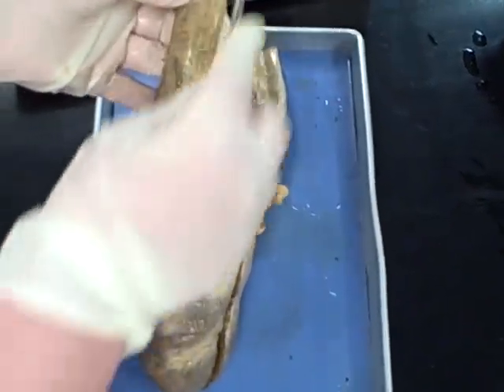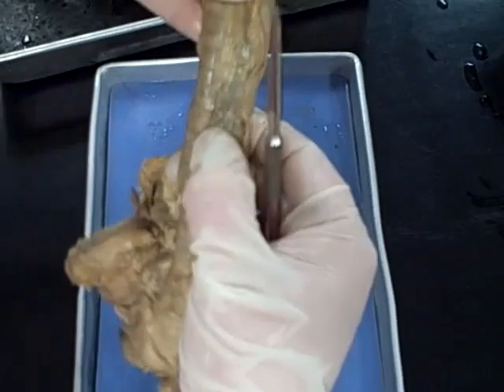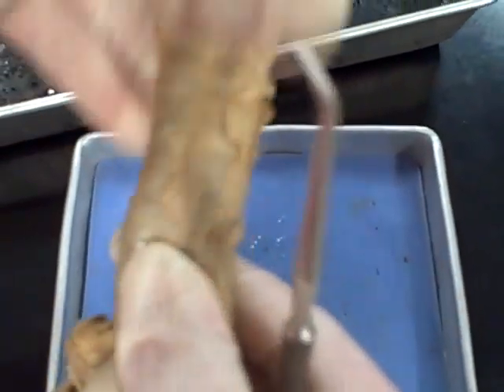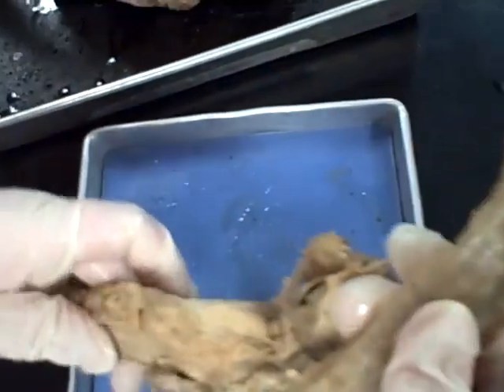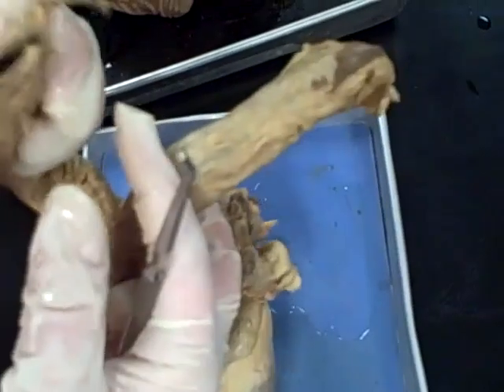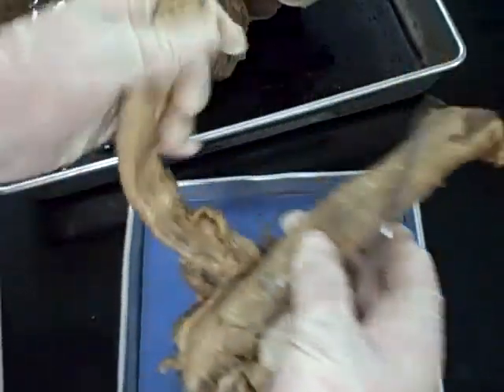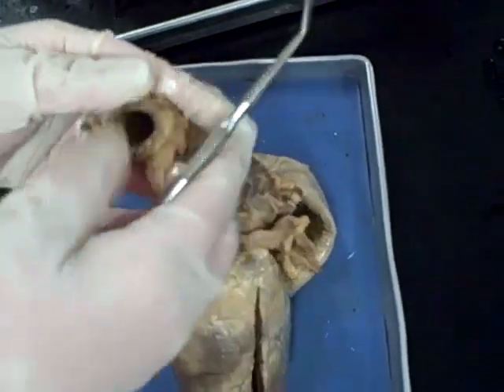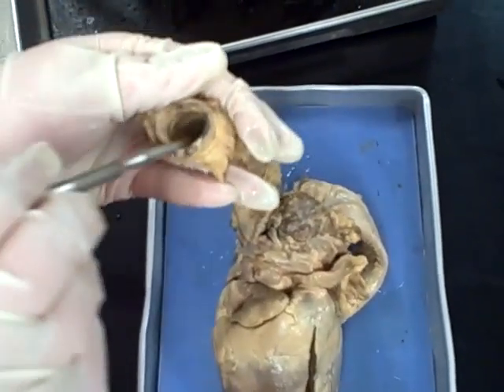We have the trachea here. The membranous portion of the trachea is along the back — it's really hard to video but you can see that it collapses more there. Behind that would be where your esophagus goes. Inside your trachea it would be all a mucus membrane.